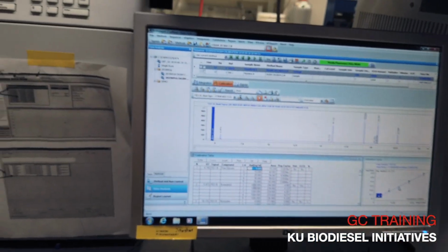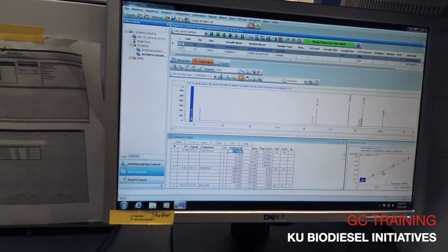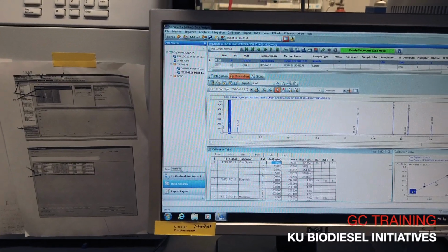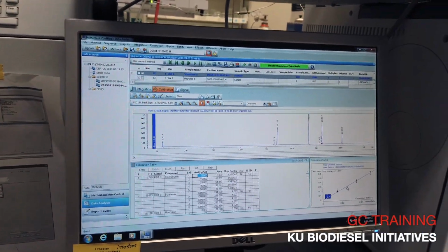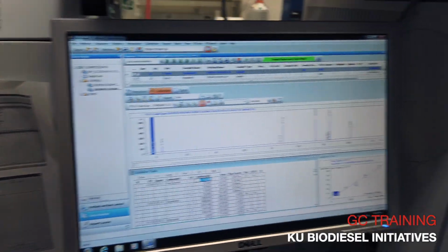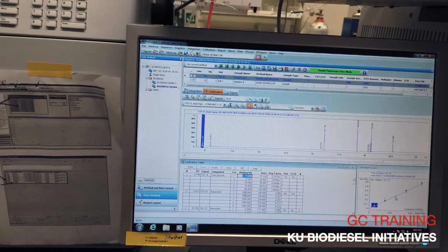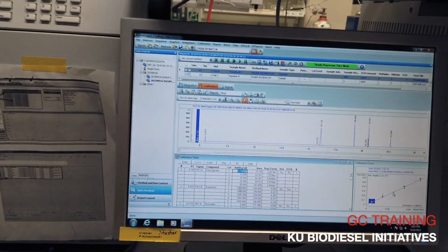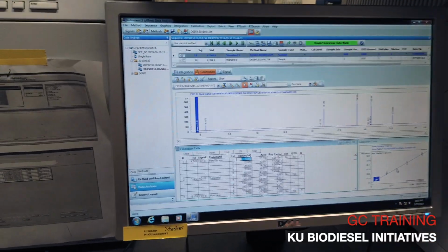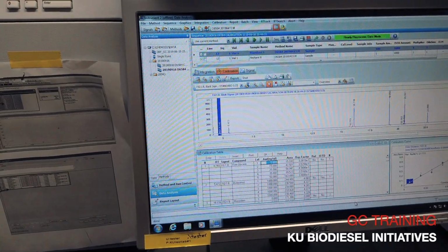But I think what would make most sense is to designate another time, or I don't know if you guys want to stay now. I guess we could test one of those fuels, and then when we do that, we can go through and fully update the calibration curve, and then check the QC. Maybe next week. Yeah, next week. I don't think we should do the test.